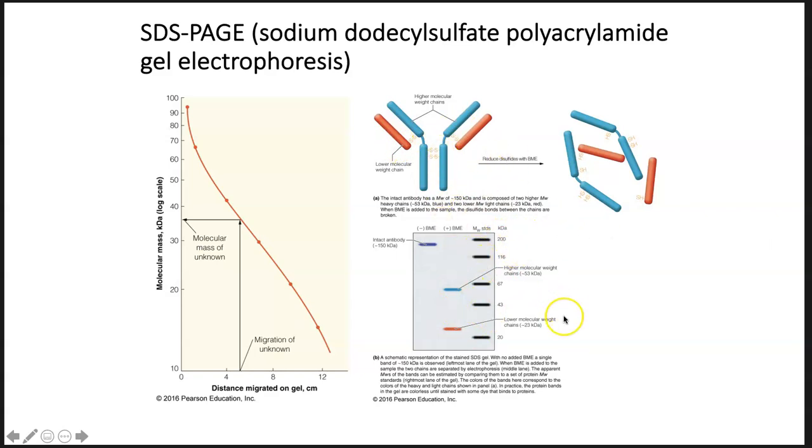So this is a commonly used technique in order to tell the purity of your protein sample that you're investigating, and incredibly useful because you can use it to tell the molecular weight of the protein that you're working with.